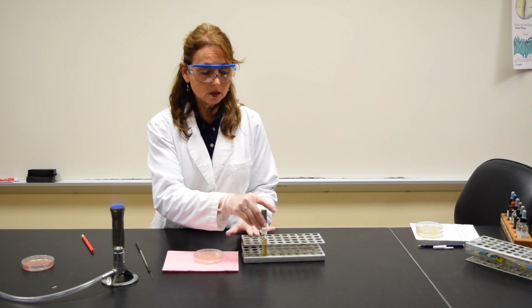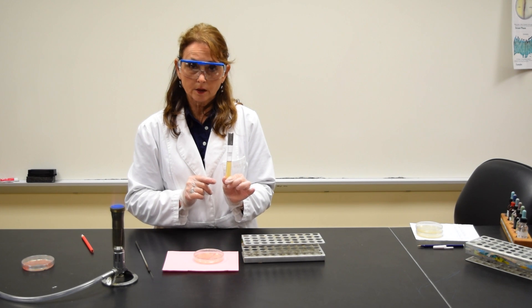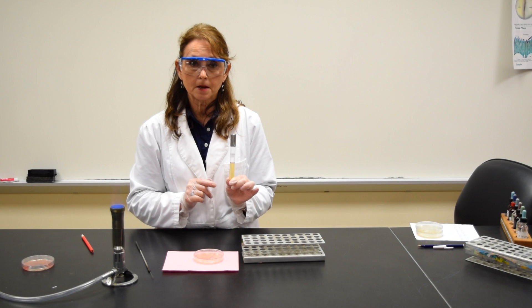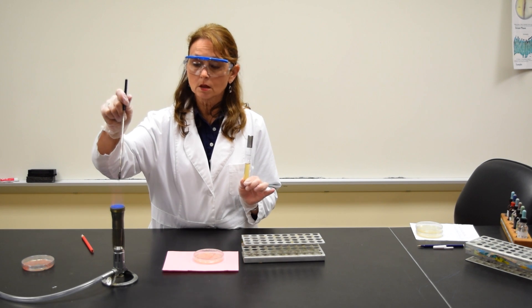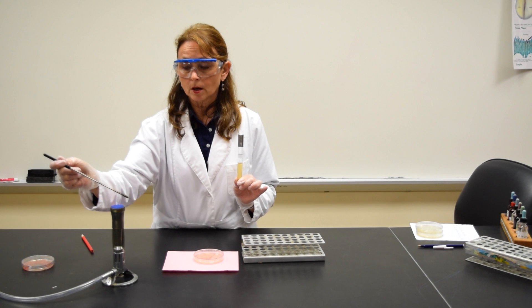I'm going to be using a test tube of bacteria in a liquid called a broth. This is known as a mixed culture broth because there are several types of bacteria that I placed in the tube. You're going to start by taking your inoculating loop and sterilizing the loop, the wire, as well as the bottom part of the handle.